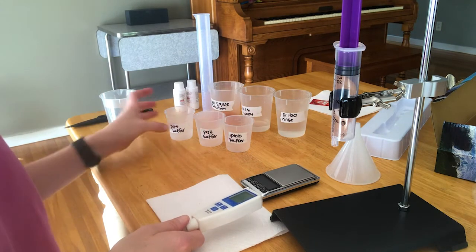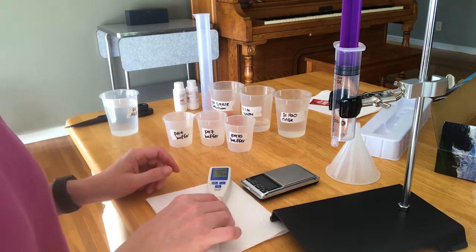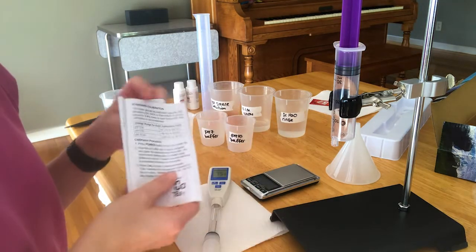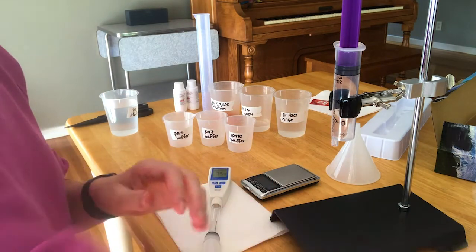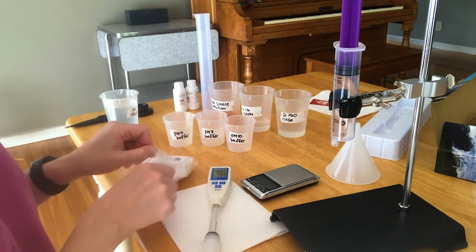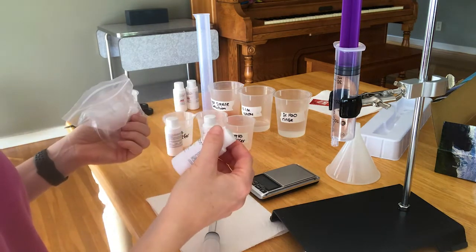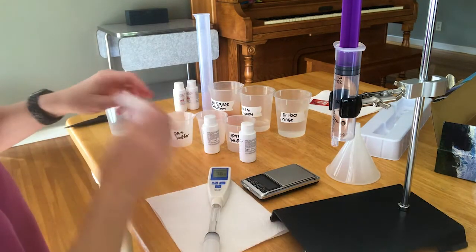We're going to calibrate it using these three buffers that come with your kit. These act as reference solutions so that the pH meter knows what a pH 4, a pH 7, and a pH 10 solution looks like. The instructions are in the booklet that comes with your pH meter, so you're just going to perform a standard calibration. We have a pH 7, a pH 4, and a pH 10, so we're doing a three-point calibration. This is even better than what we do in person at Fullerton, where we normally just do a two-point calibration.